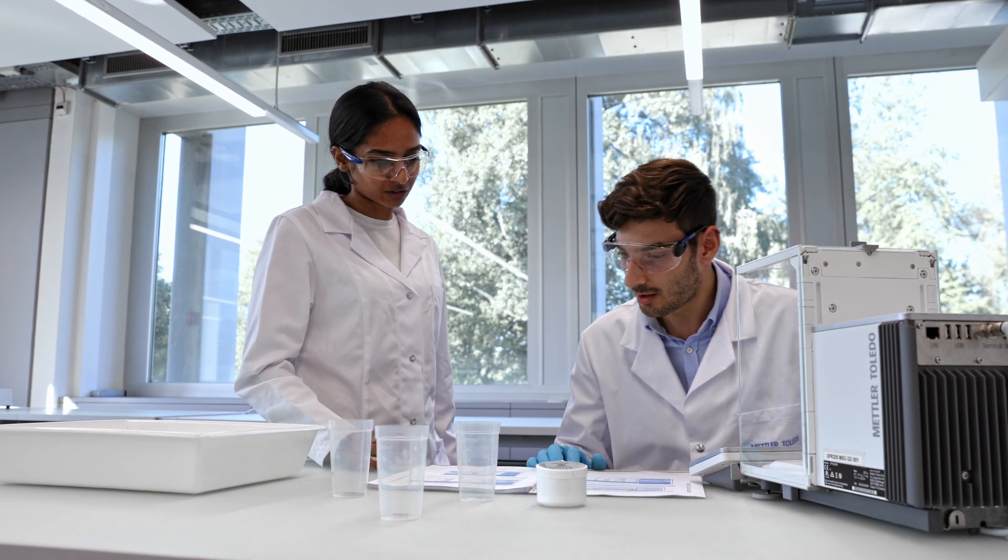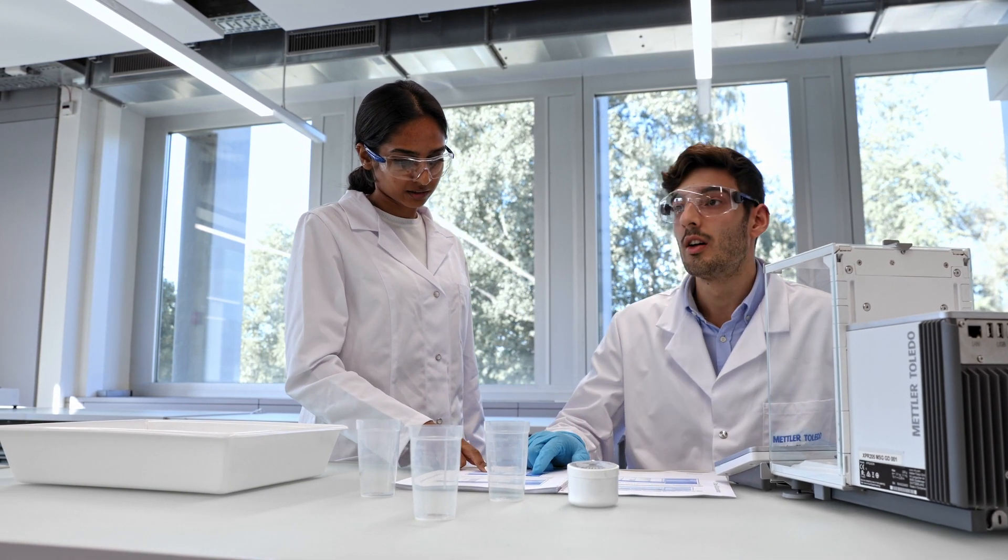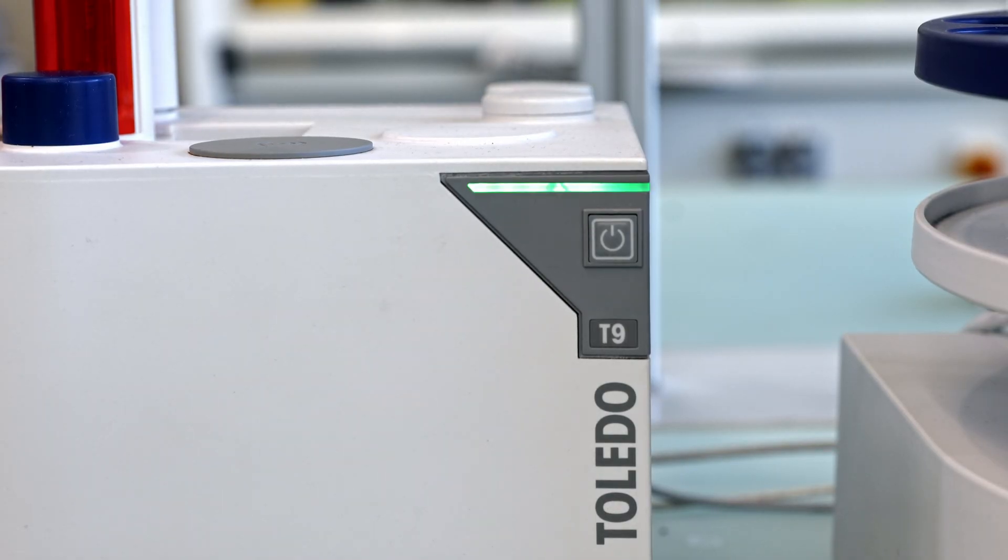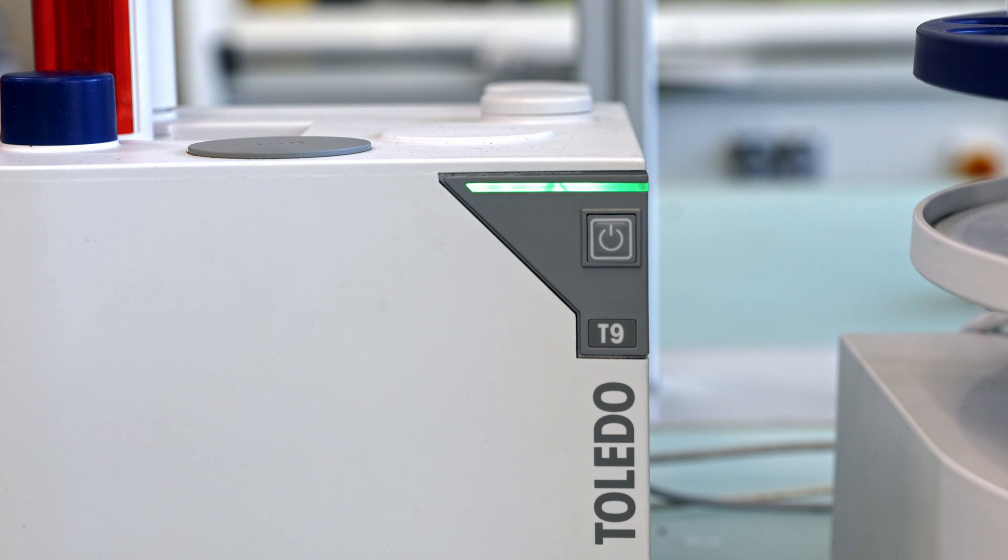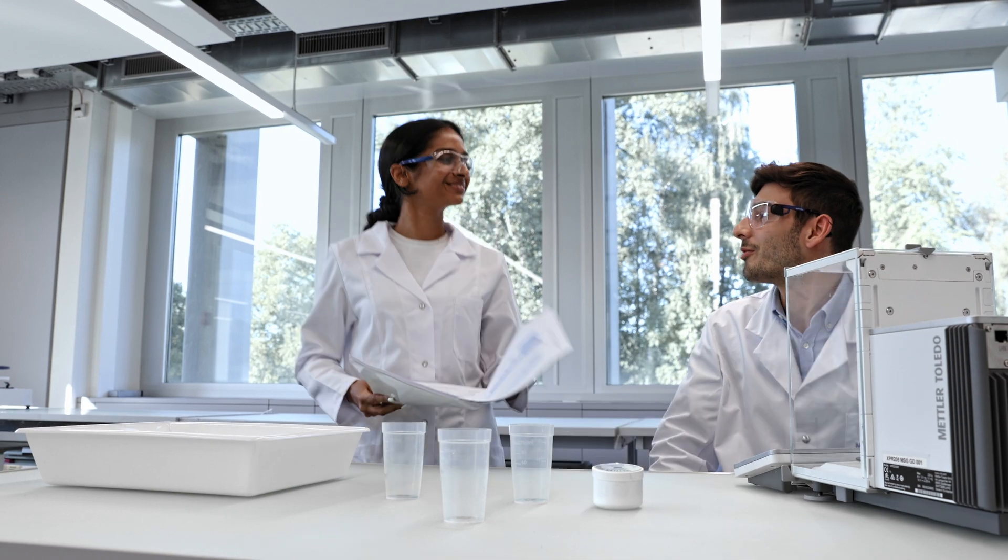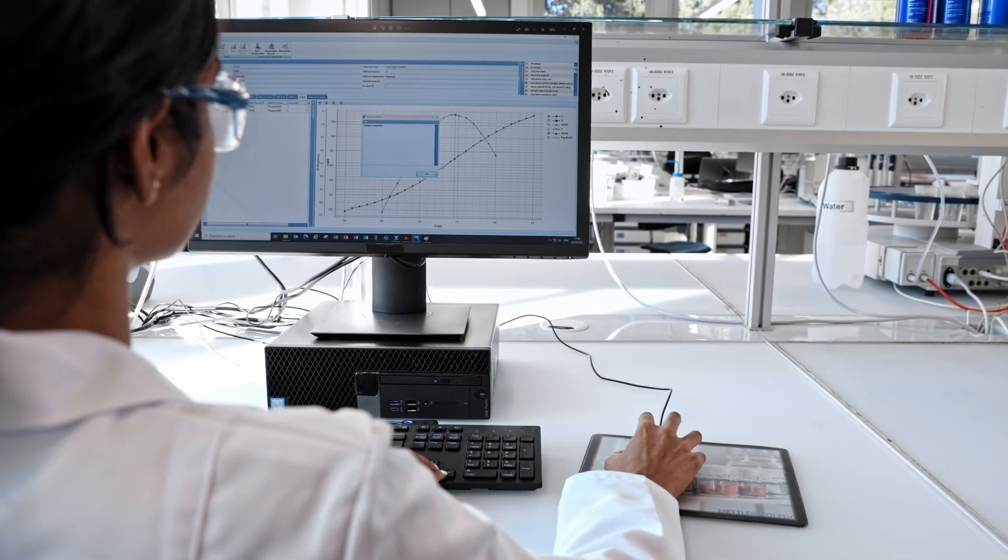Stay in touch with the titrator from anywhere in the laboratory. The status light makes sure that you are using your time efficiently, signaling when the instrument is ready to use, busy, or needs some further attention.